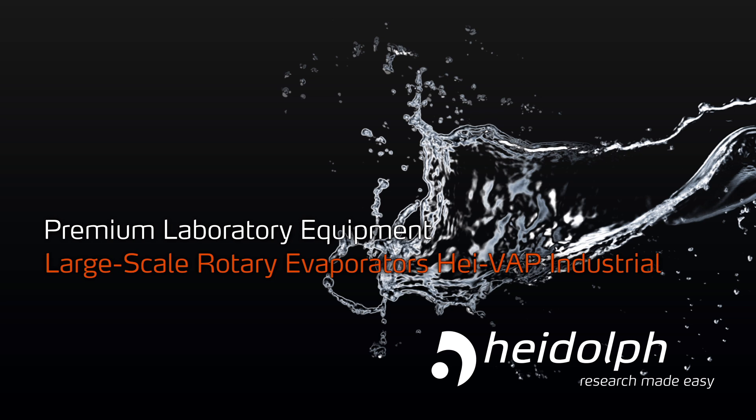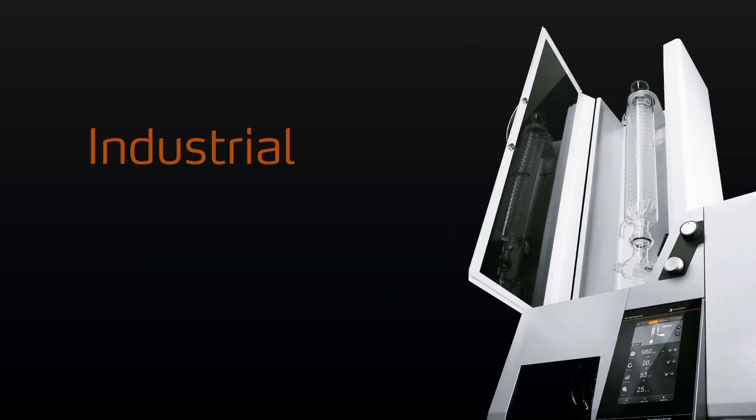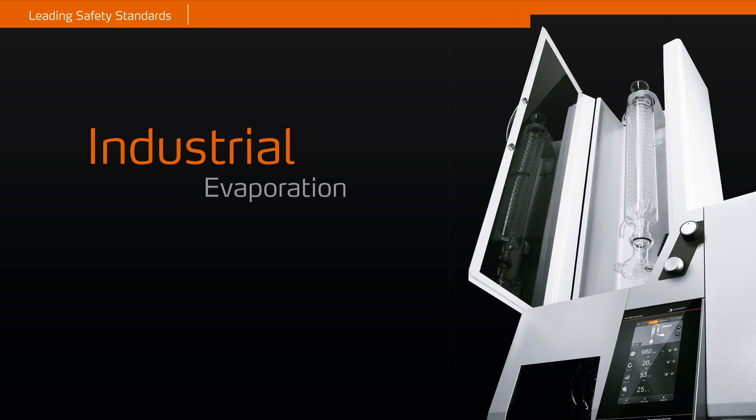Large-scale rotary evaporators of the HiVap Industrial Series. Industrial Evaporation.